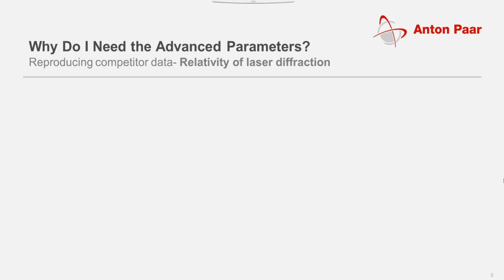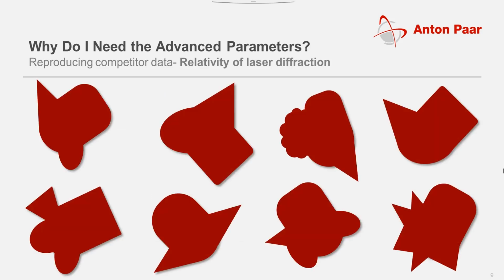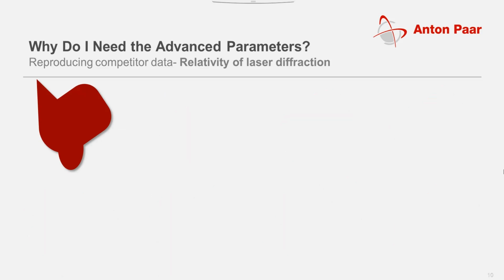Typically, in a dispersion, you have a mixture of particles with a similar size but different shape. Let's assume this will look like the one in the slide. If we take the following particle, a different diffraction center could be chosen. If one single diffraction center, like the green circle, is chosen, the reported particle size would be monodispersed because one single particle size would be detected.